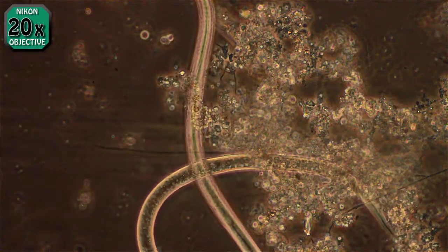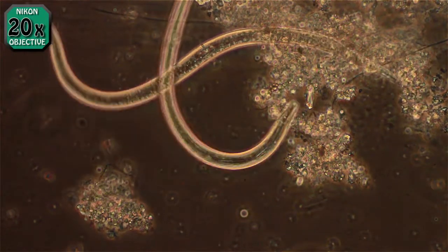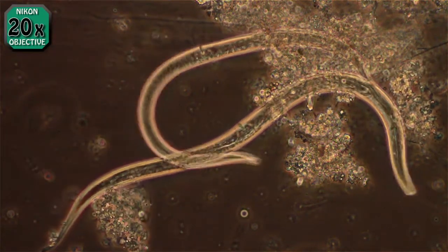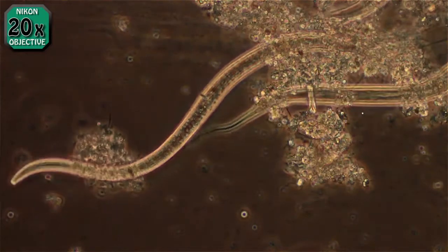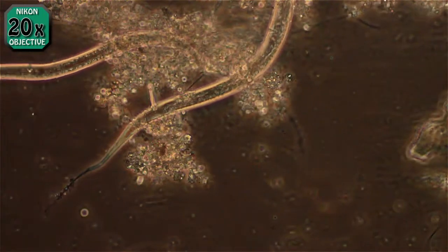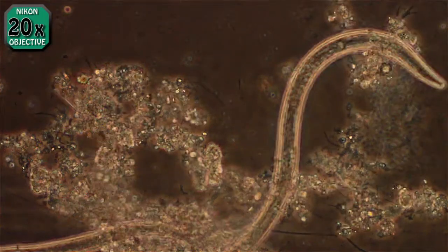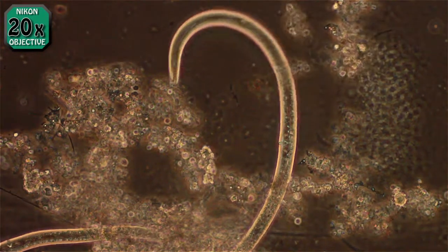This sample is from a scraping with a Q-tip. I flushed a toilet in the back room, and while the water was going down and the water level was low, I ran the Q-tip across some of the scum that grows under the water line on the inside of the toilet. This is some of the things that grow in it.